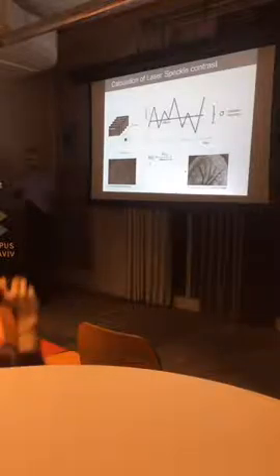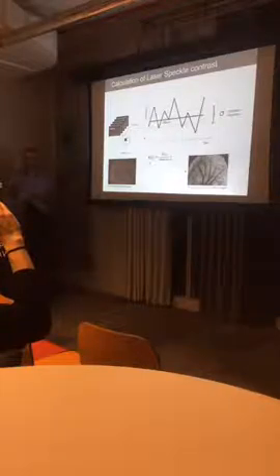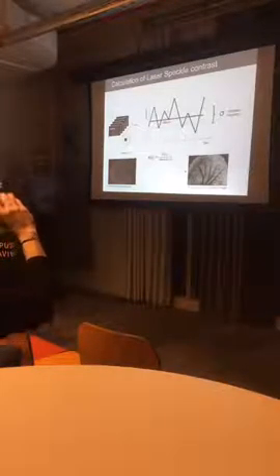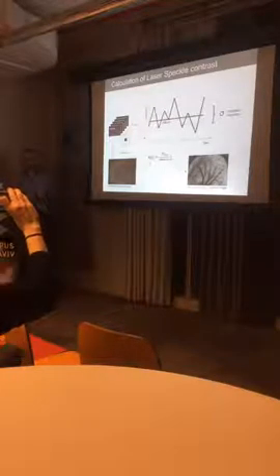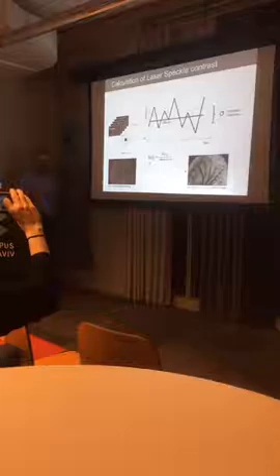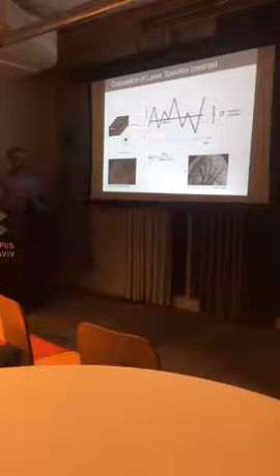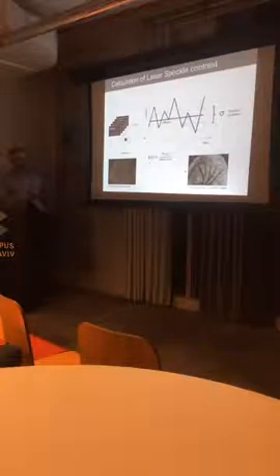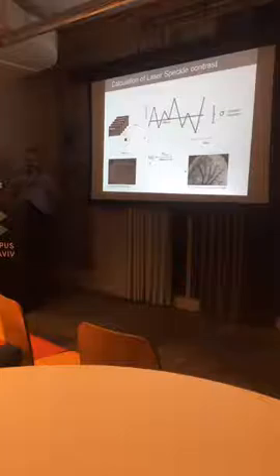Why does it happen? Because of light scattering. What we collect is scattered light, and light scattering depends on what happens with the scattering particles. If there is a flow, there is blurring. I will not go deep into all this physics, but the idea is very simple: more scatter, more motion inside, more blurring. And we have this pattern of the blood vessels. What is interesting is that we can see it much deeper inside the tissue than with the standard method and standard microscopy.